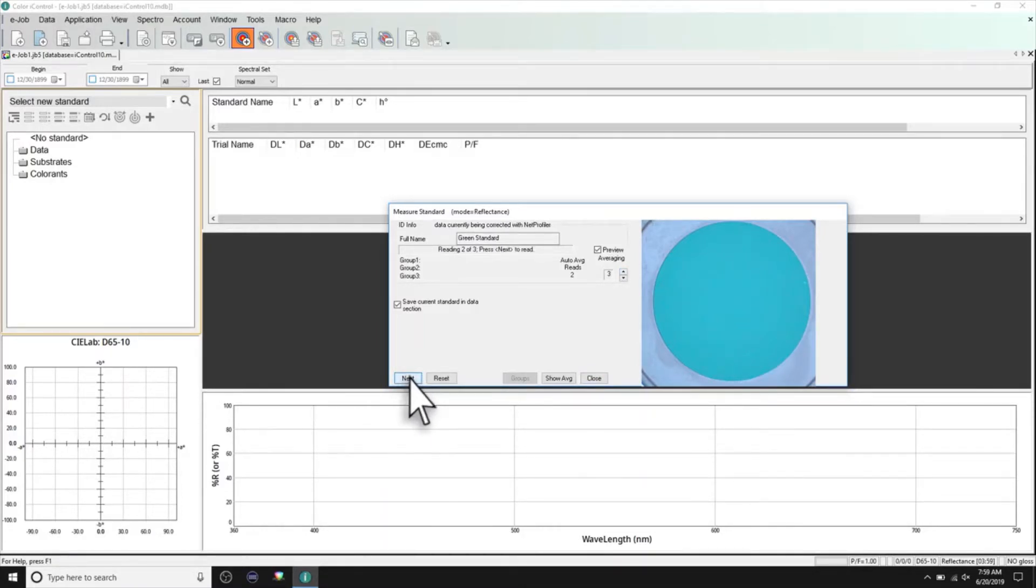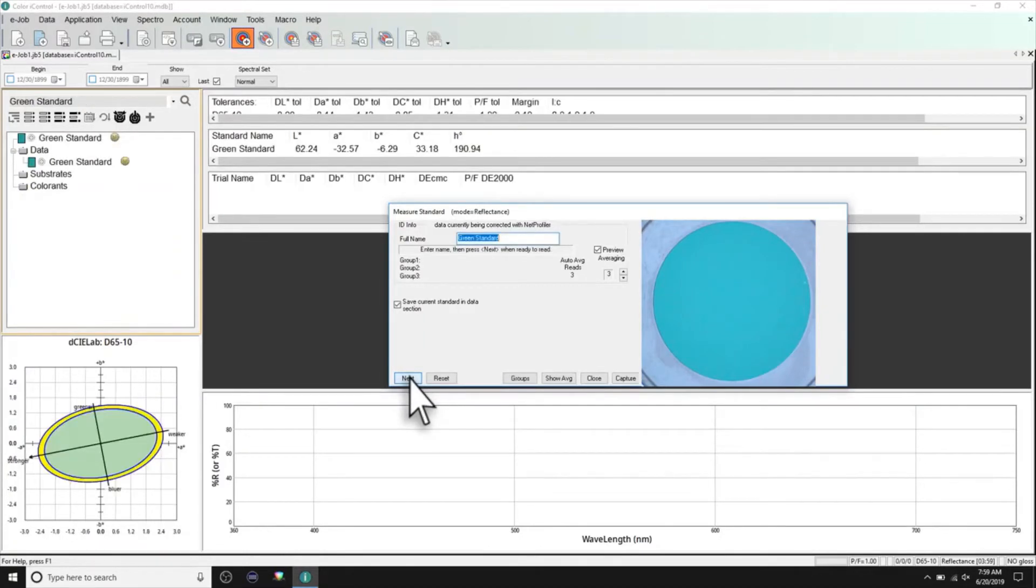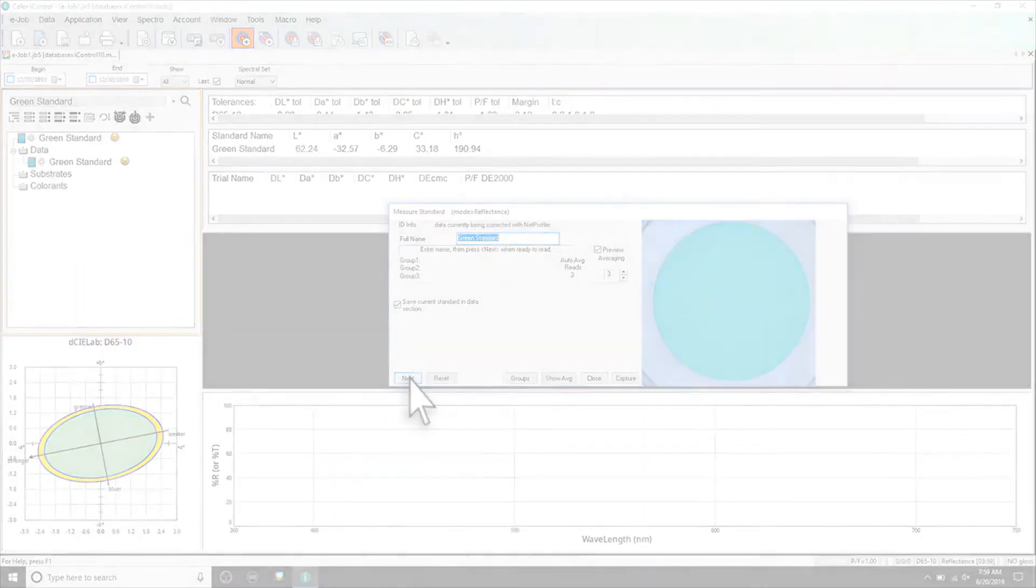If averaging measurements, continue taking all required measurements. The measurement will be shown in your software application.